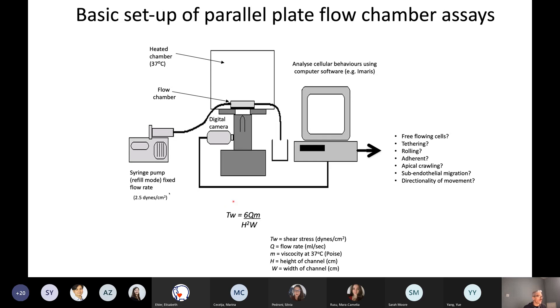We use an equation to calculate the shear stress — you need to know the flow rate, the viscosity of the liquid you're using, and the dimensions of your flow chamber. Nowadays we use a digital camera to view all interactions and bespoke software to look at various cellular behaviours over the course of the experiment. We're able to determine how many cells are in free flow, how many are tethering, rolling, adhering, crawling on the apical aspect of the endothelium, or beneath the endothelium — and to monitor the directionality of their movement.